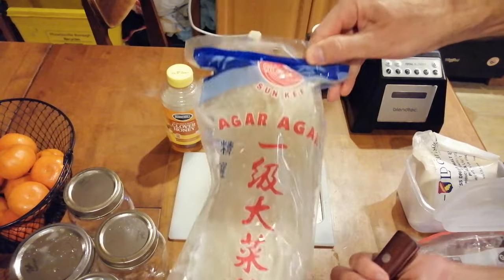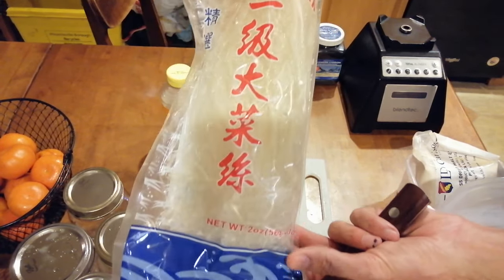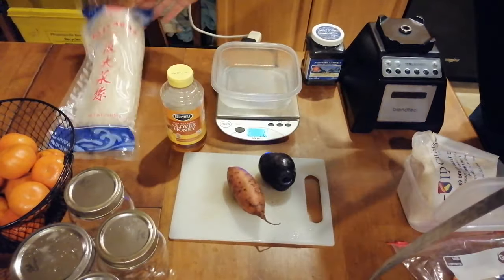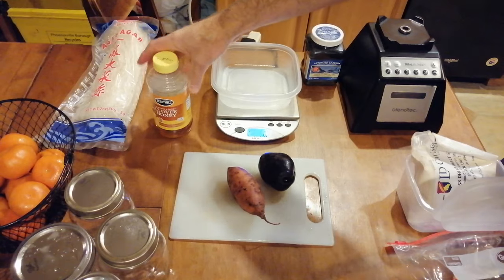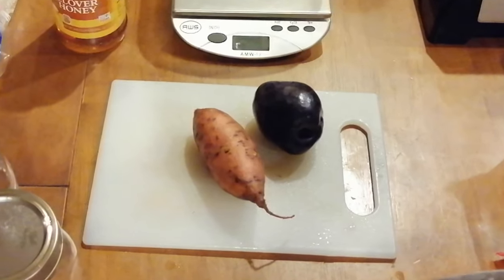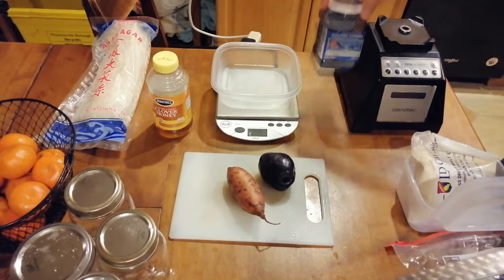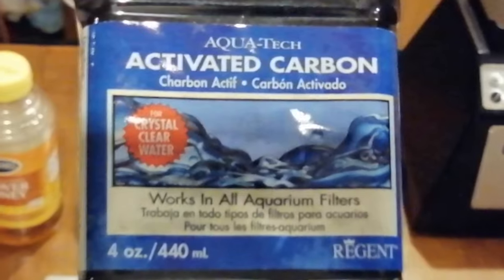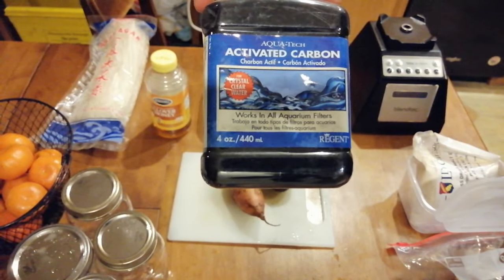You will of course need some agar agar, which you can buy online or find at most Asian grocery stores. Two ounces is really all you need — you can also buy it pre-powdered. I will be using honey only for the potato dextrose agar recipe. If you will be making potato dextrose agar or PDA, then you will need one medium-sized potato — any type will be fine. To make black agar you will need some activated carbon.